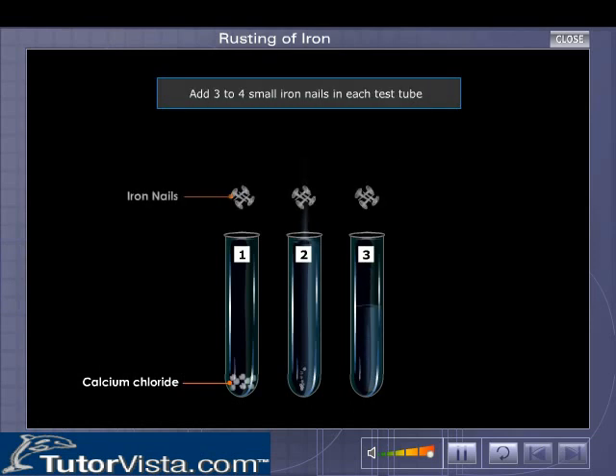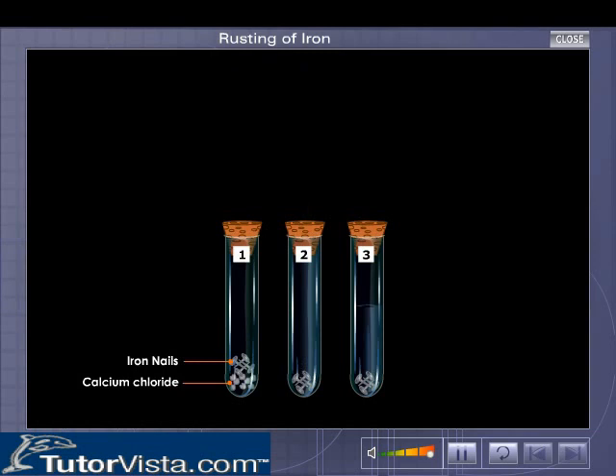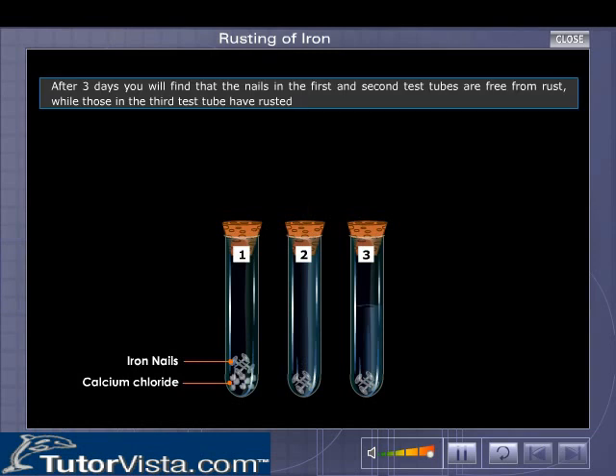Now put three to four small iron nails in each test tube. Plug the mouth of all the three test tubes. After three days, take out the nails and examine them closely.